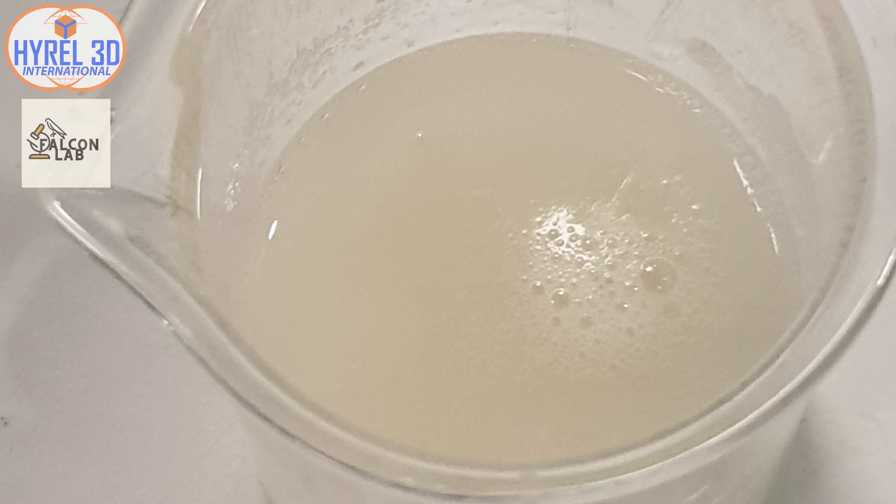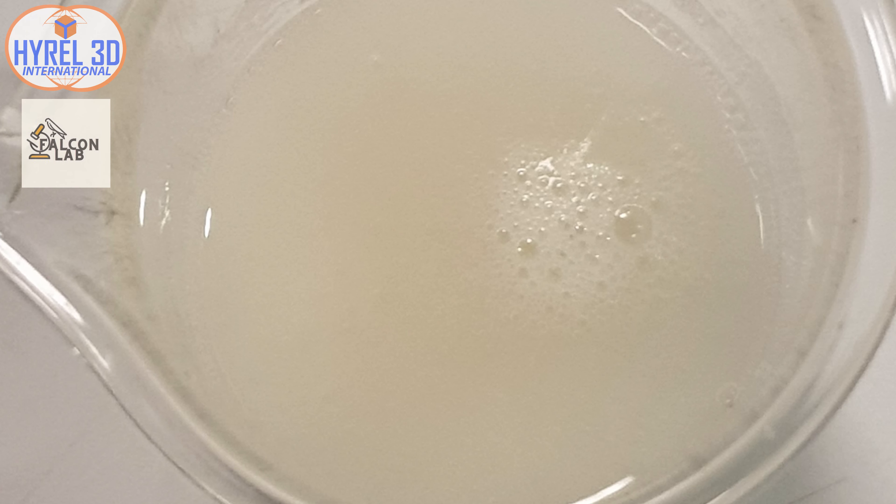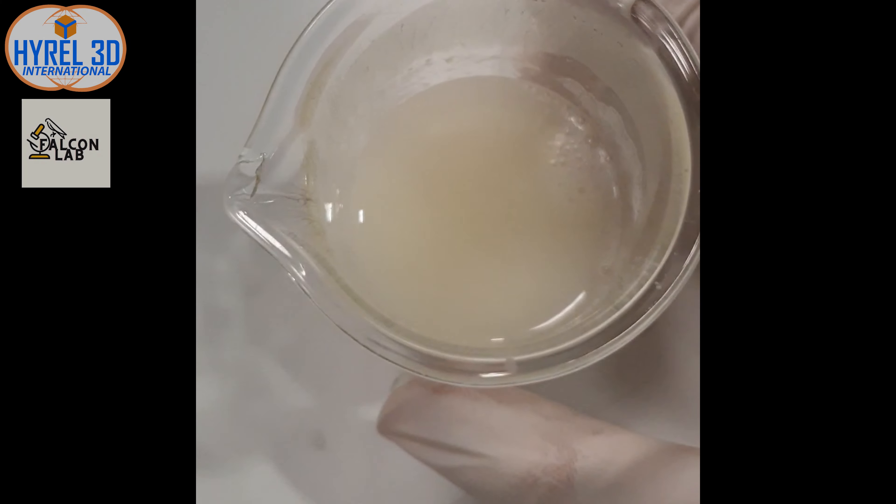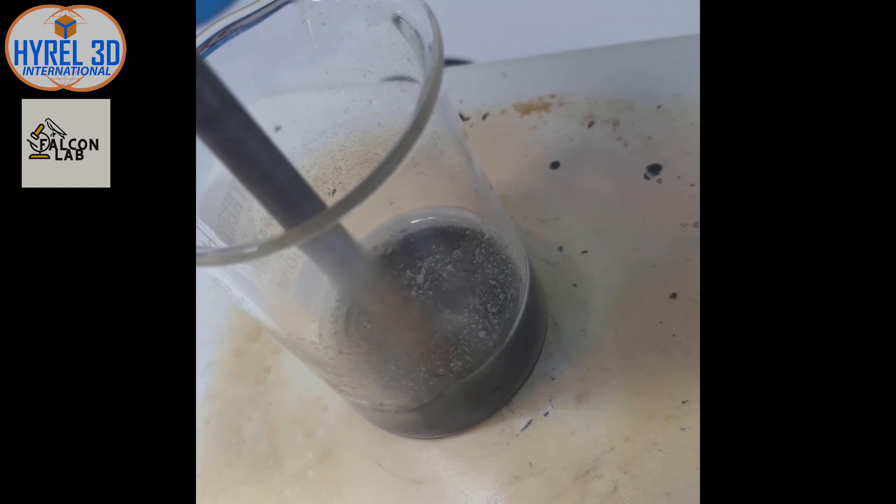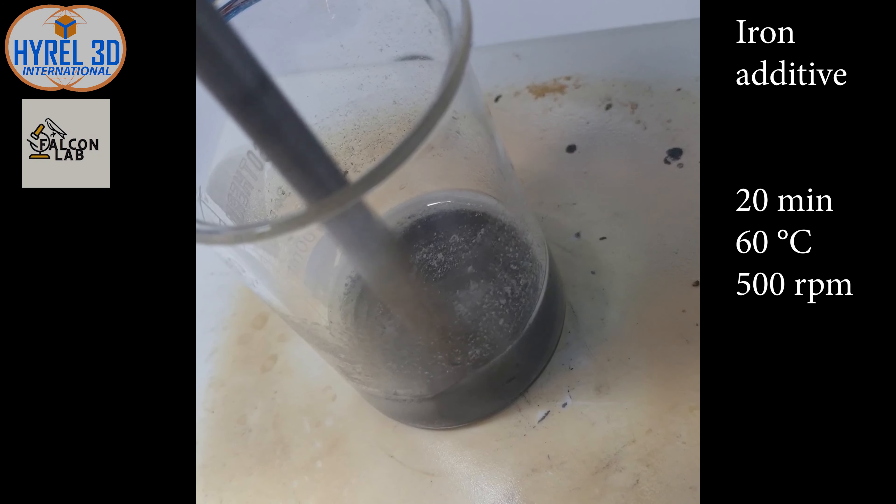After we finish mixing the hydrogel, you can notice the formation of air bubbles and foam on the surface of the mixture. We will get rid of them later. We will prepare a mixture of iron flakes and hydrogel that we have prepared in advance to be used as a material for scaffold printing.